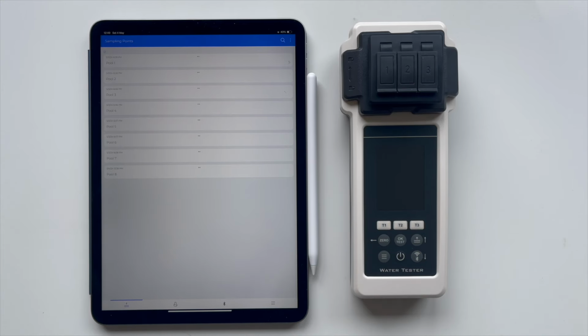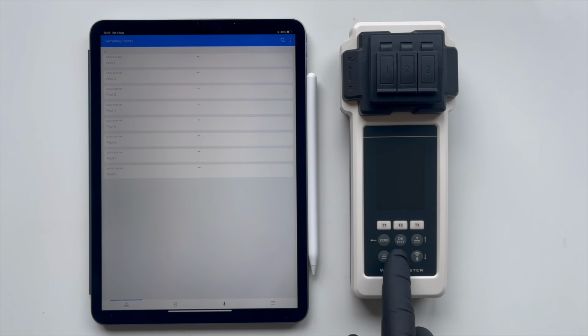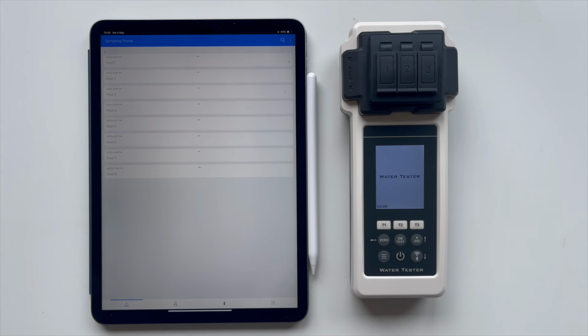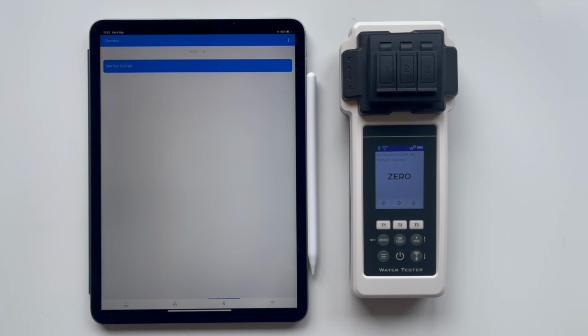Next, we need to transfer the sampling points from the app to the tester. Turn on the tester. To transfer the sampling points, we need to activate Bluetooth. Press the Bluetooth button with a very quick double click. In the app, navigate to the Bluetooth menu and connect with the water tester.